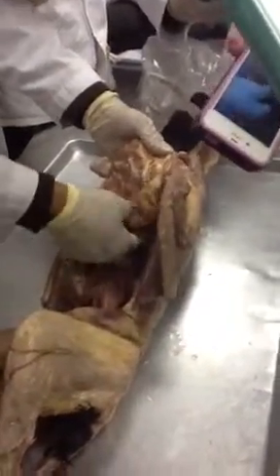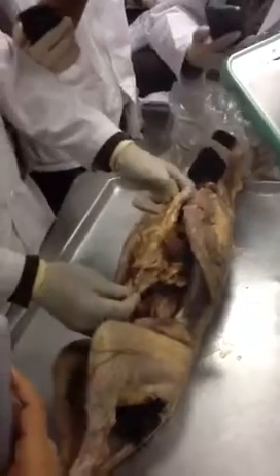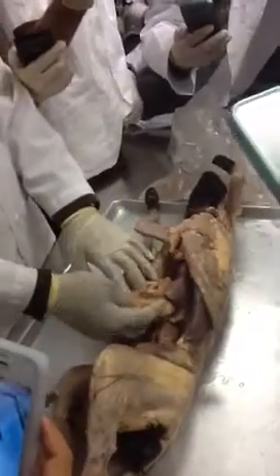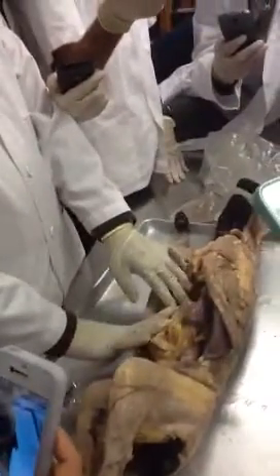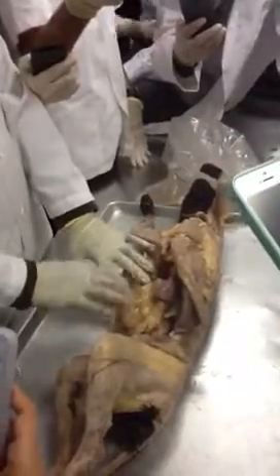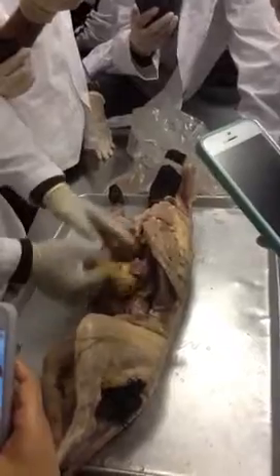Here we have the large gut. I'm actually going to remove this one, then you will find the large gut over there. So you can see it's actually double folded. This is not simply a fatty thing. Yes, fat is in there, but it is called the abdominal policeman. I told you that if there is any pathology, it guards. Normally it covers the anterior part of the intestine, so the intestine can be safe. So this is the greater omentum.